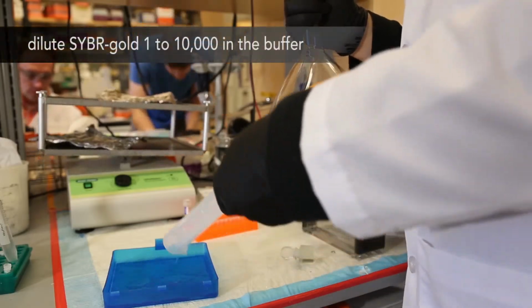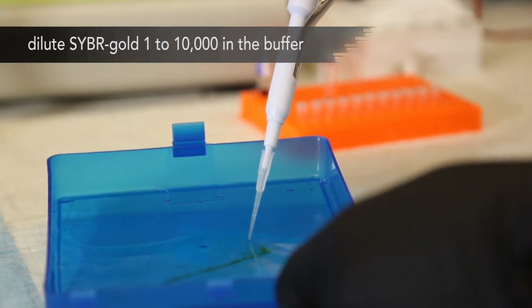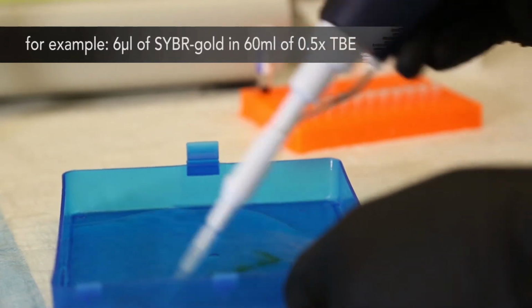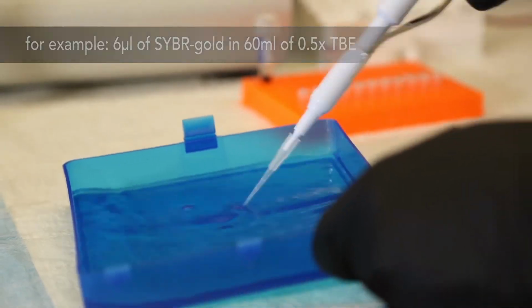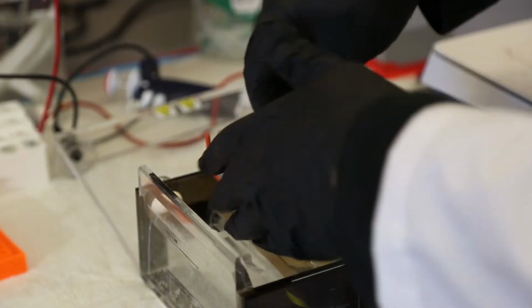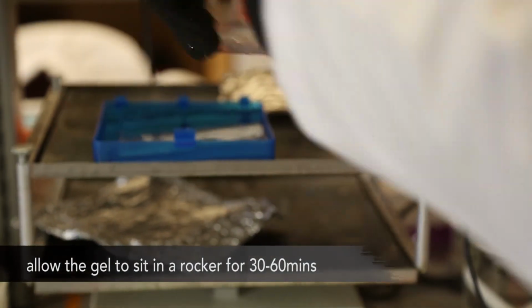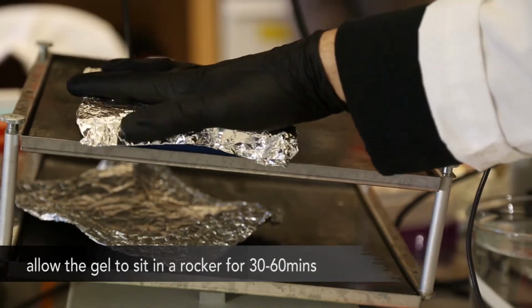In a container slightly larger than the gel, dilute the SYBR-gold 1 to 10,000 in the running buffer. For example, 6 microliters of stock SYBR-gold in 60 milliliters of 0.5x TBE. We recommend using SYBR-gold for maximum sensitivity when staining the gel. Allow the gel to sit and stain on a rocker for at least 30 minutes. 1 hour usually leads to more even staining.